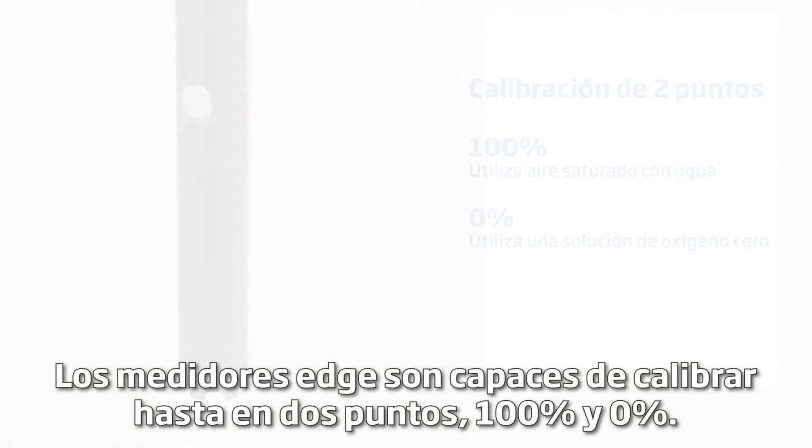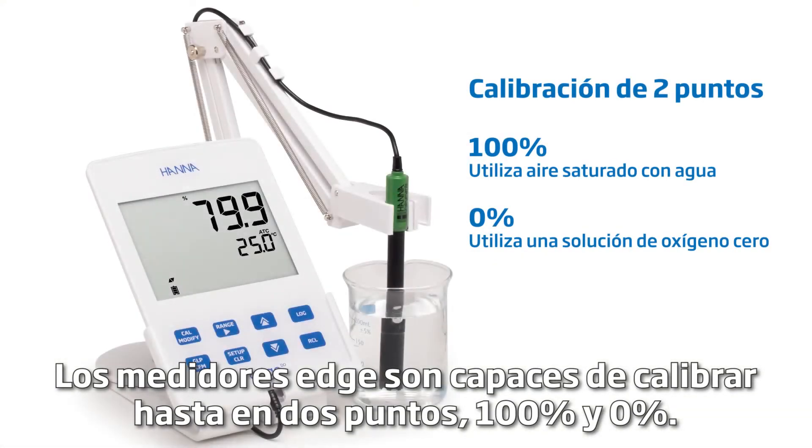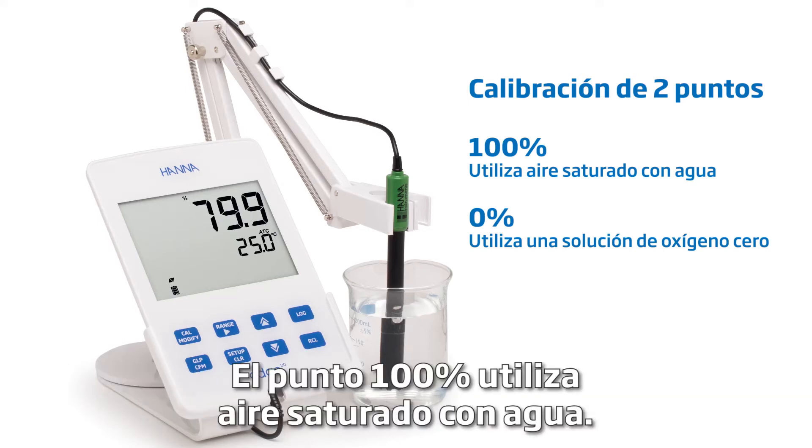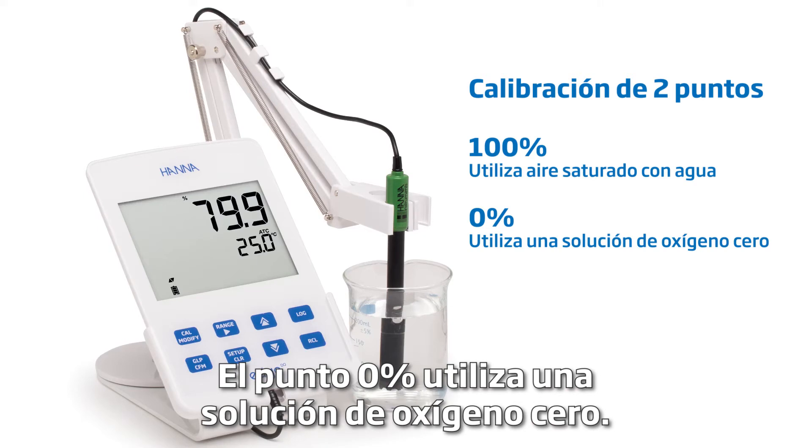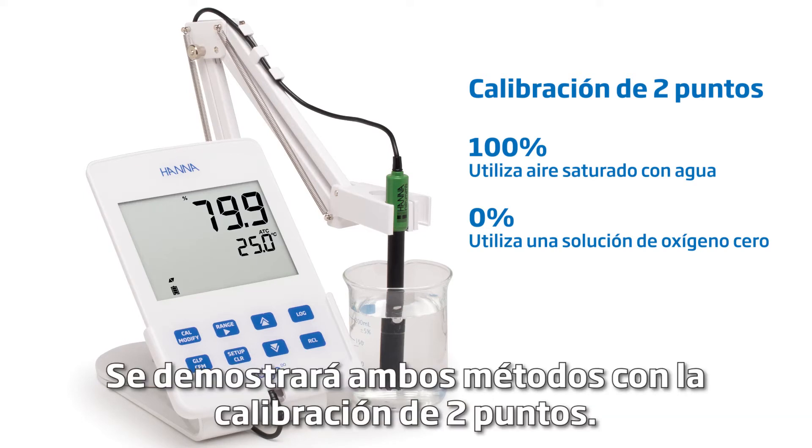Edge meters are capable of calibrating at up to 2 points: 100% and 0%. The 100% point uses water-saturated air, and the 0% point uses a 0 oxygen solution. We'll demonstrate both methods with a 2-point calibration.